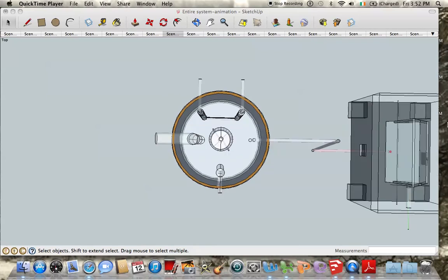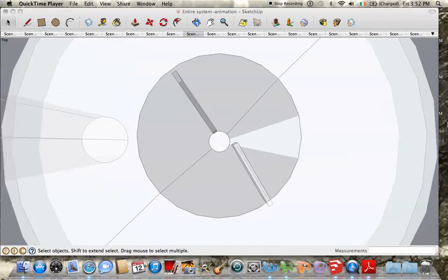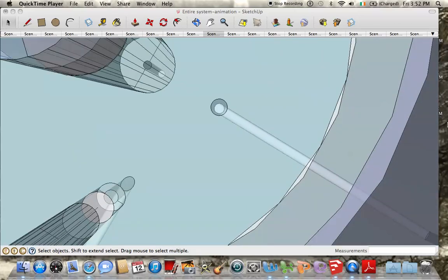Because this is a continuously stirred tank reactor, or CSTR, there is a motor which propels two paddles at the bottom. As the camera moves down the shafts, we can see two of the paddles at the bottom which continuously stir the organic material in the anaerobic digester. In reality, there's actually 8 paddles.